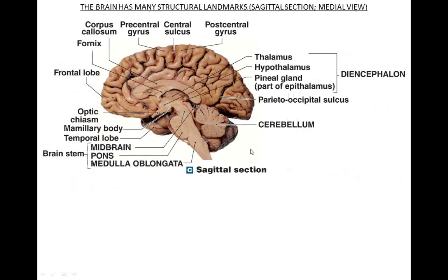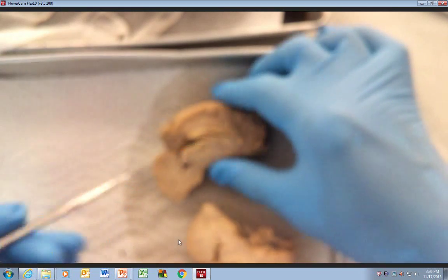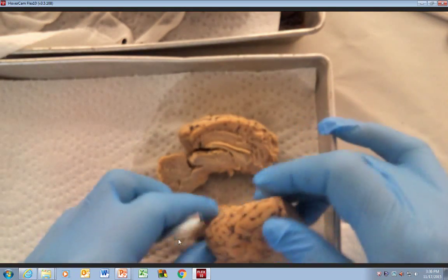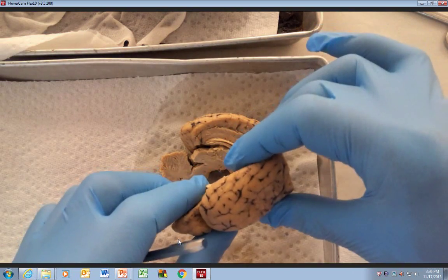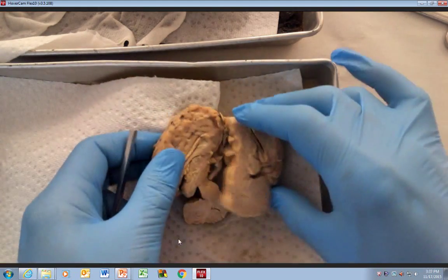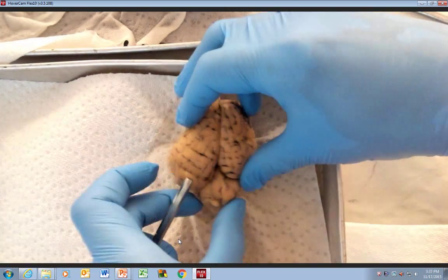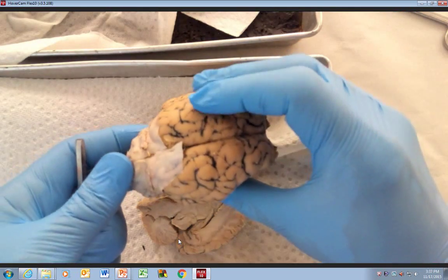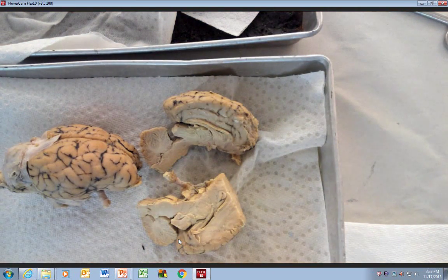So we'll go back to the actual live view here. That's what I was trying to show — this is one of the lateral ventricles. You can just get our different frames of reference here. This was the other side here. This is the right hemisphere and this is the left. Remember, these are connected by the corpus callosum — that's why information goes back and forth between the different hemispheres through that. There's your dissected brain. Here's the dura removed and non-sectioned, and here's your sectioned one. That's going to conclude our video for today.